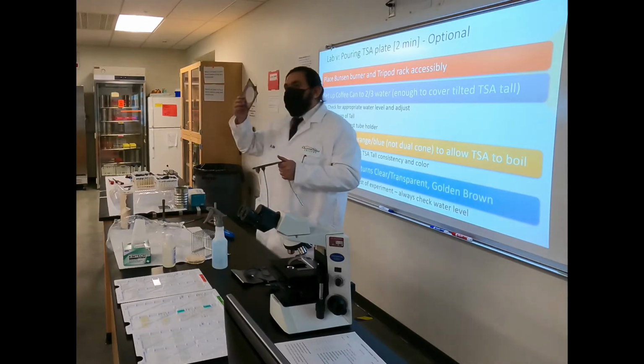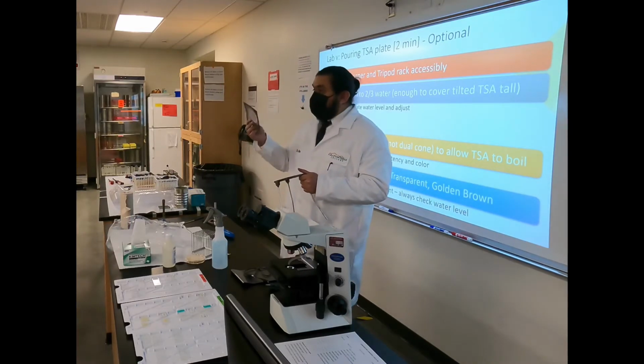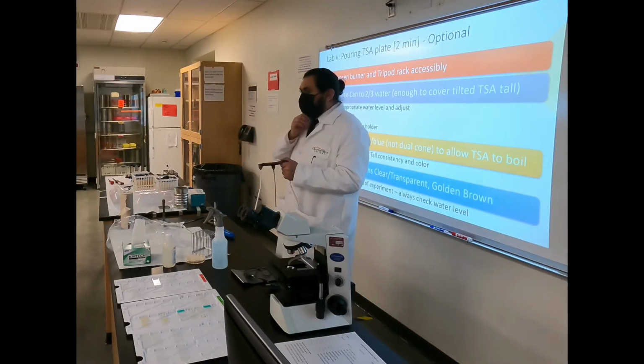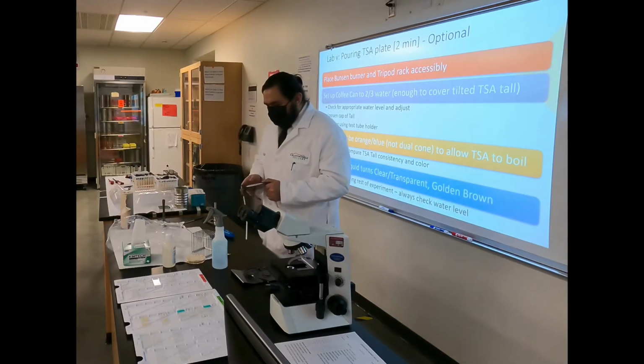Now everybody's going to have a wire gauze, again, part of the common stuff. Some of them may have holes for the geniuses that forgot to turn their flame and burnt a hole through it. Or they used the dual cone instead of a blue flame. So it happens. Now don't worry, it's fine, it's not going to break down. But let that be a kind of a learning lesson.